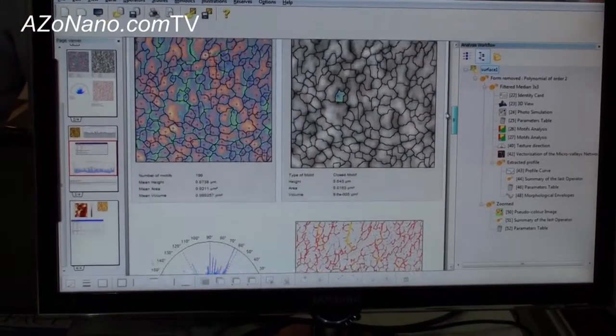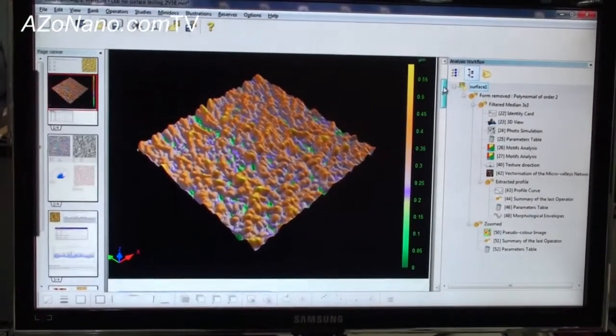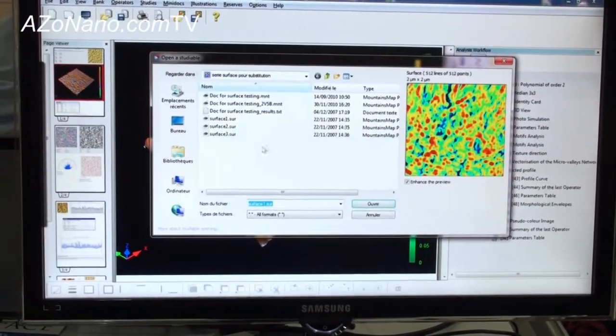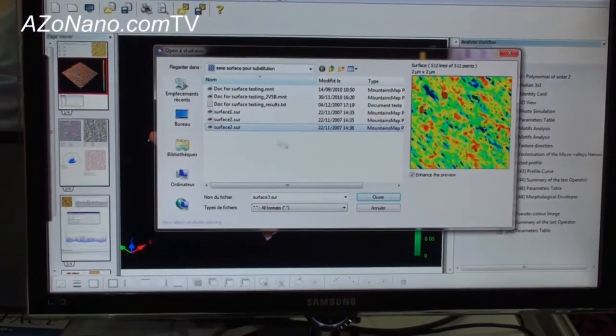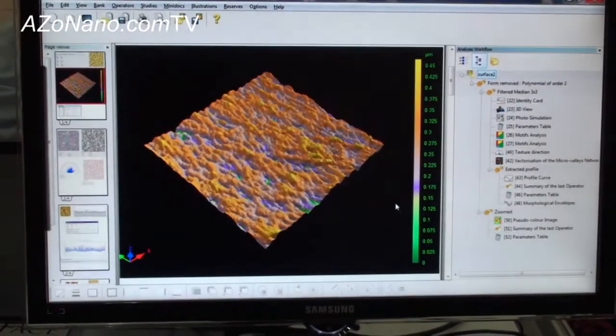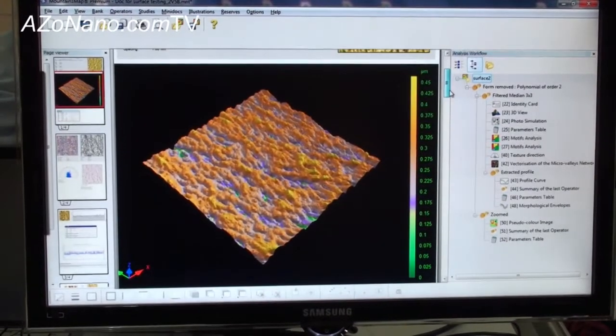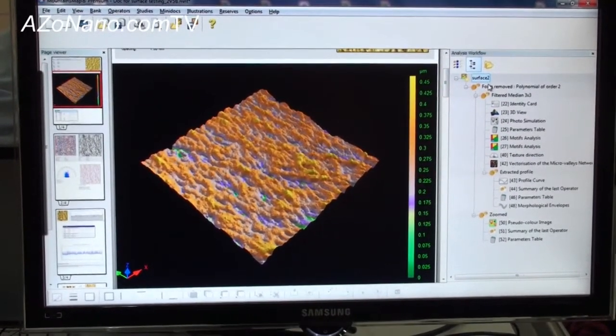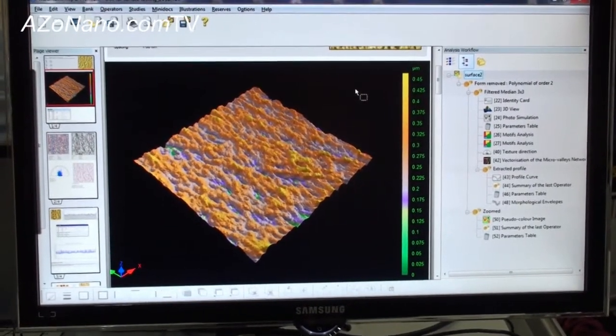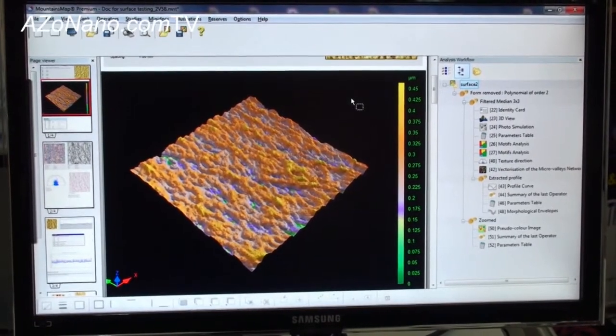So you can see that all features now, all analysis, all studies refer to the surface number one. And if I do it again, I can make maybe surface number two. So everything could be refreshed by a simple clicking on a mouse. So any document can be used as a template and could be applied on a series of measurements. So this is a general benefit of the mountain software technology.